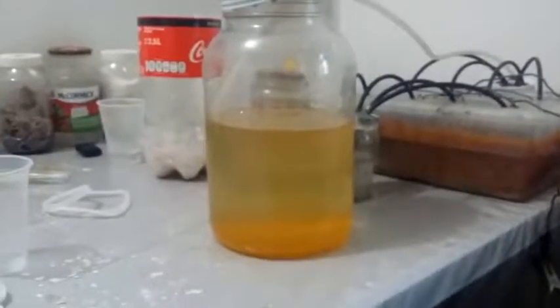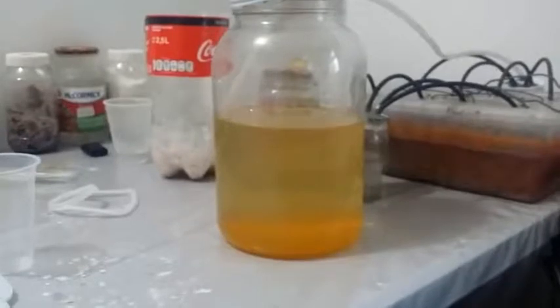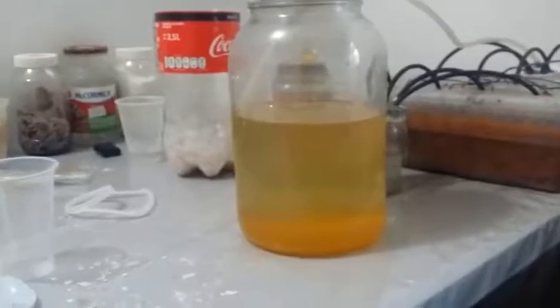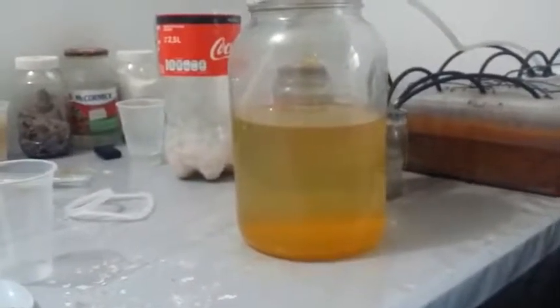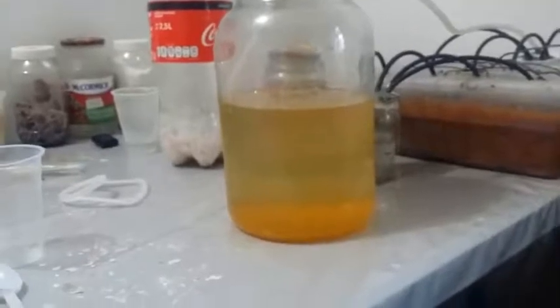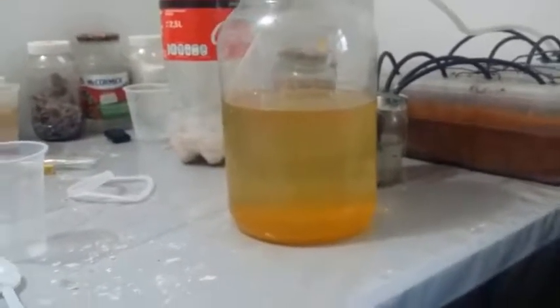It does seem to be working, but it's a very slow process. I did make some batteries out of this solution. This started off as a 3 molar solution — it's evaporated down a bit, so it's probably close to its maximum concentration by now, maybe around 3.5 molar, and probably about to start crystallizing.